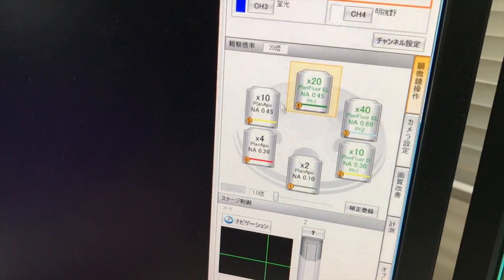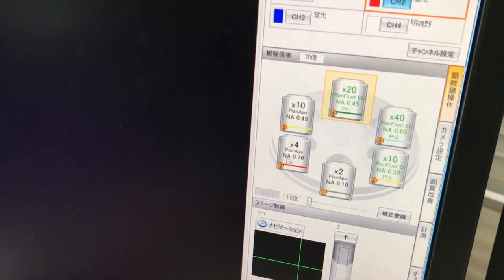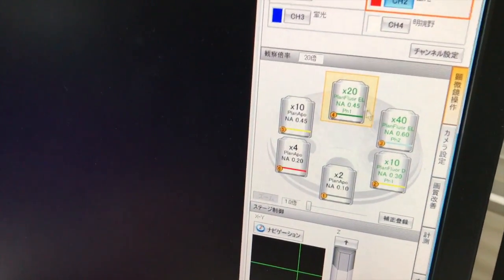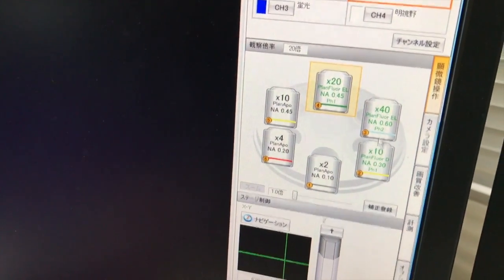But for fluorescence, you cannot use this one. I see. Because fluorescence is needed. Yes, it's a special. Special.